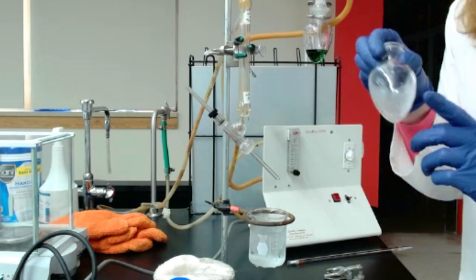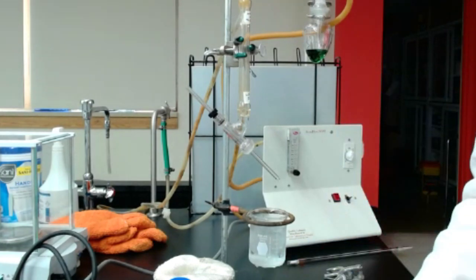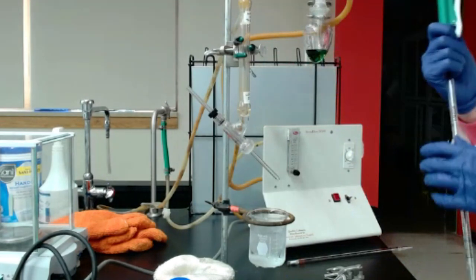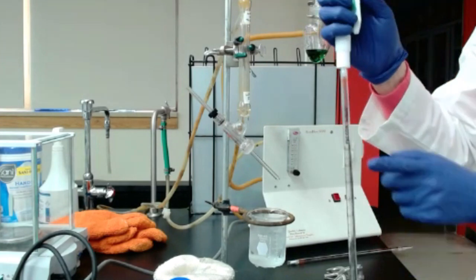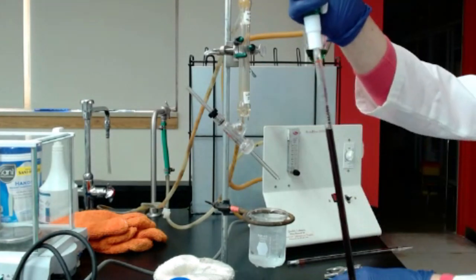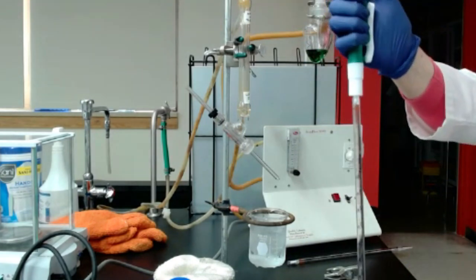So in that other flask, the cold flask, that's in cold temperature, that's where you're going to have your wine. We're going to do the wine that we shipped to you last time. You will use a pipette as well, and you will need 20 milliliters. So once again, I'm going to pipette twice, just making sure I have 20 milliliters, not too much, but enough. All right, so I just transfer and then redo it.